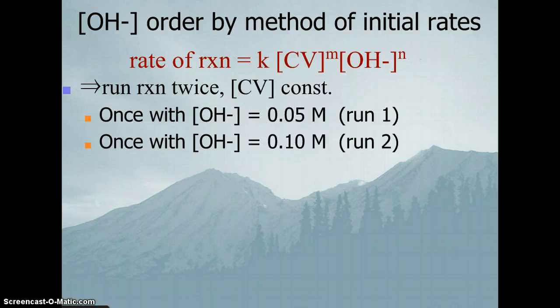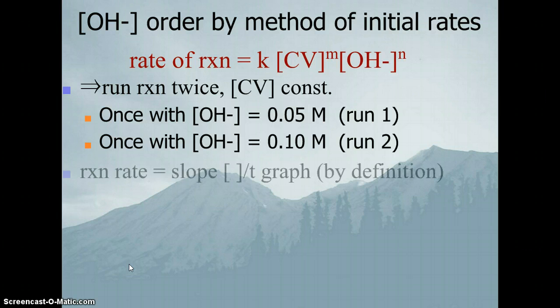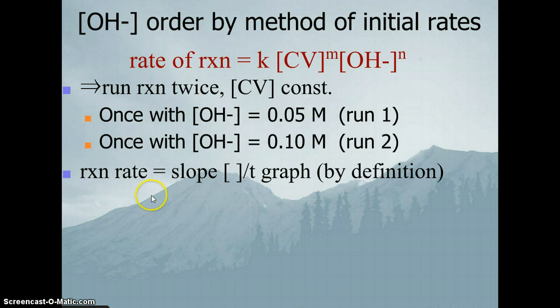In the method of initial rates, we run the reaction under a certain set of conditions. We keep the concentration of crystal violet the same, then run the reaction with hydroxide ion at 0.05 molar. We monitor the change in concentration of crystal violet over time — graphing change in concentration versus change in time — and that by definition is our rate of reaction. We only run it for about 30 seconds to get the initial rate right at the beginning.